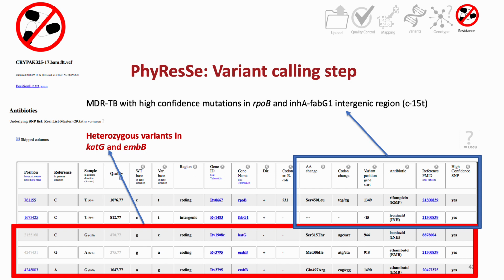Just finding the variants is not important. The more important thing is to look at the variants, to gather all the knowledge we have about the variants, and to make the right and 100% correct interpretation of the variants, which can save the life of the patients.